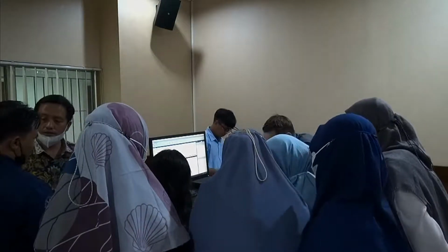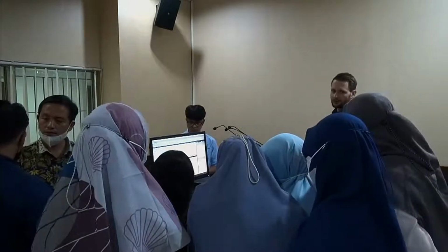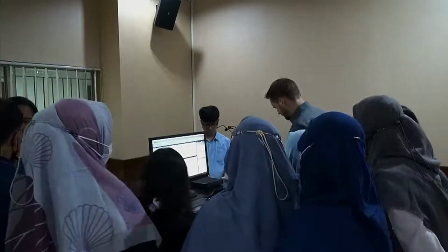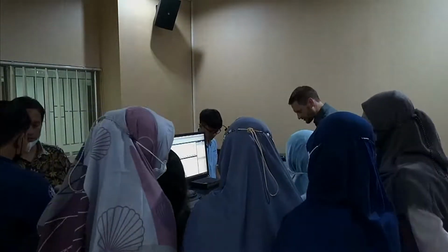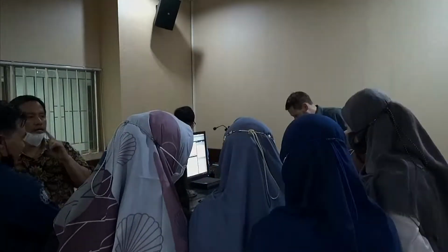What I actually would like to do is show you also a difficult sample. I didn't manage on the previous group, but maybe at the end of the day for all groups together I will show you one really difficult one. I will start with a more difficult one right now, which is this carbon black.